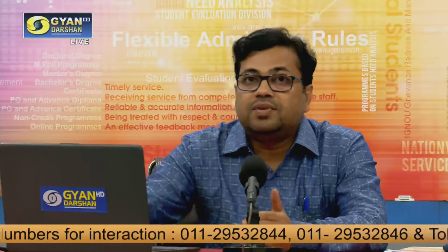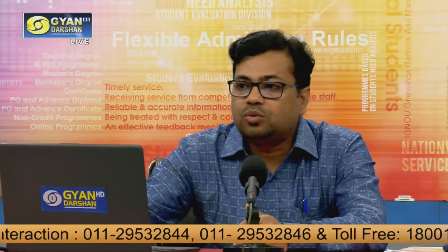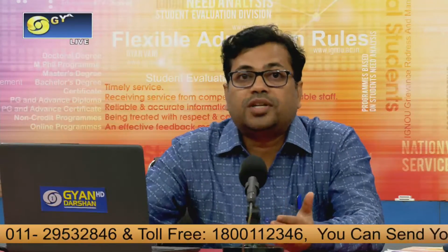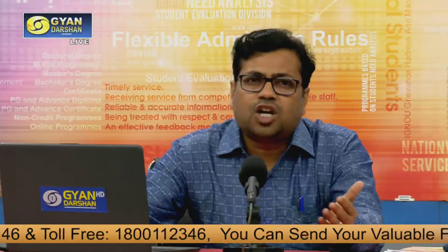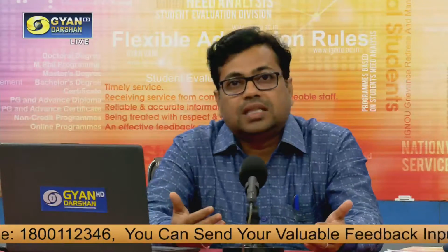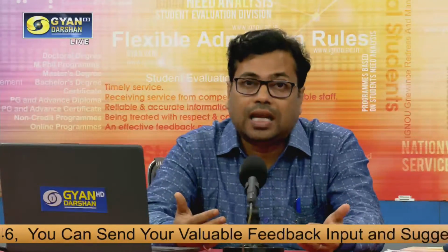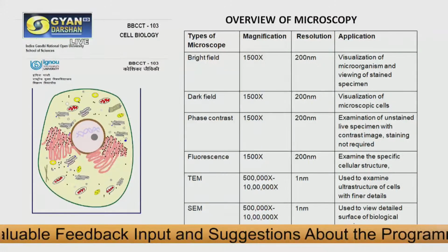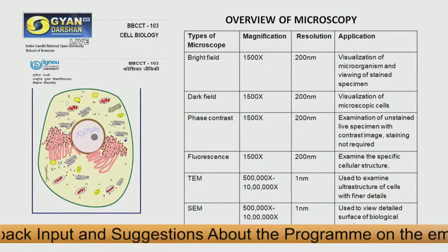Electron microscopy is quite different from light microscopy, and today we will discuss it. If you recall the previous session on optical microscopy, there are different kinds of optical microscopy used in biological labs, like bright field microscopy, dark field microscopy, phase contrast microscopy, and fluorescence microscopy.